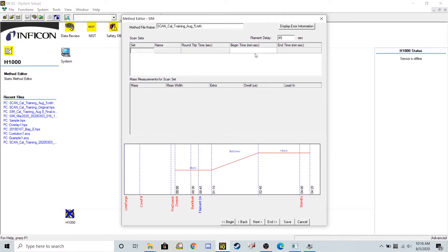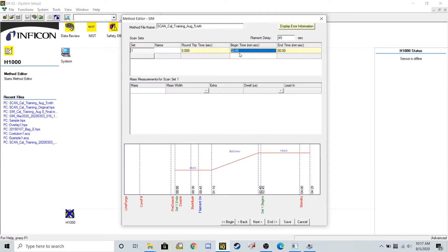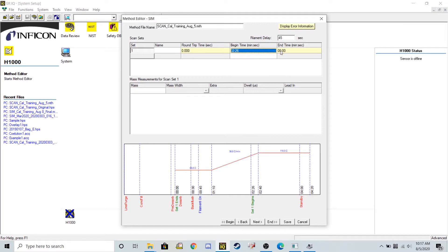I'm actually going to build my time windows to consider different chemicals. The first window that I'm going to have the mass spec open in is going to be between 2 minutes and 26 seconds and it's going to go to about 3 minutes and 17 seconds. In this window, the reason we're putting it here is because trichloroethylene is going to come out in that time period.